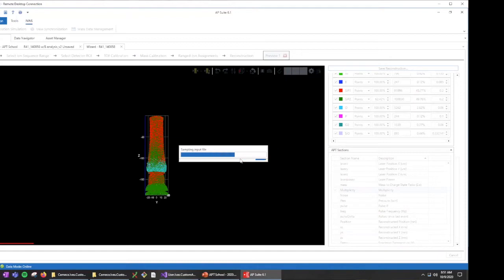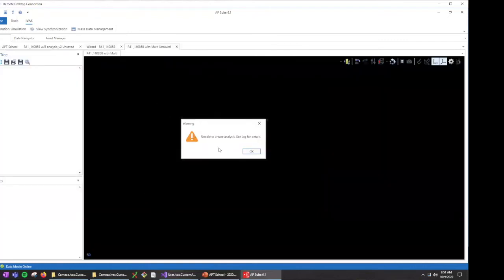So I'm not sure how many of you have, I don't know if this is your first time seeing APSuite, but the wizard should look quite familiar to you, as we basically copied the layout of the IVAS3 wizard. So it has your 7 steps, and you create a preview.